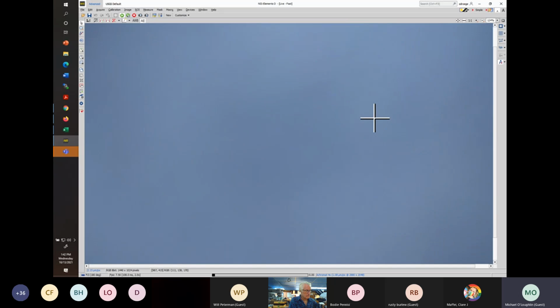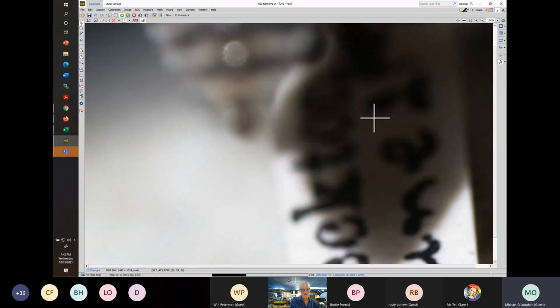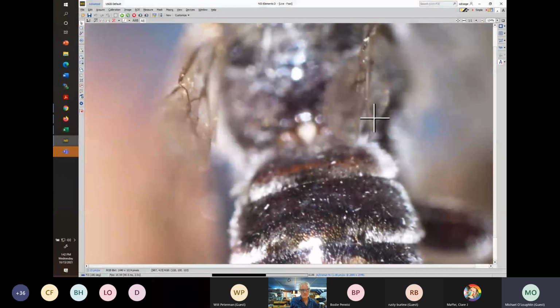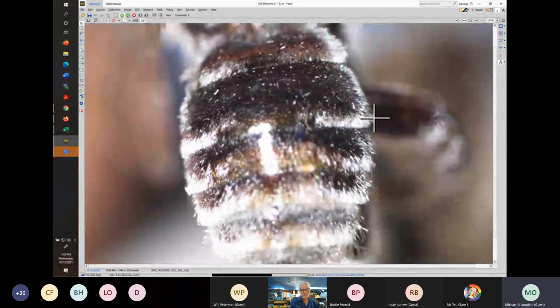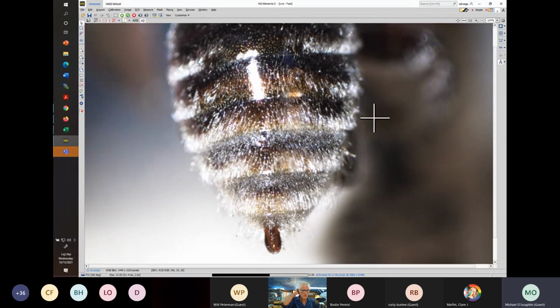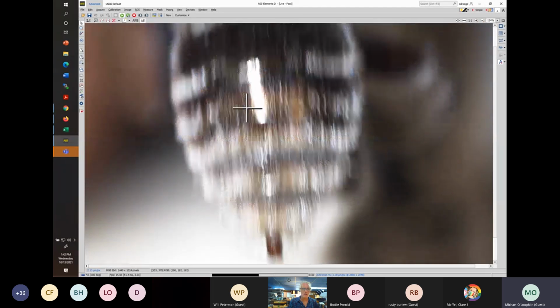And now if we look at something that I probably would disagree with, they talked about appressed hairs on the abdomen, unless this is a female, I believe it is a male, that there's either no appressed hairs, and these are more like hair bands than appressed hairs, but the visual is the same.